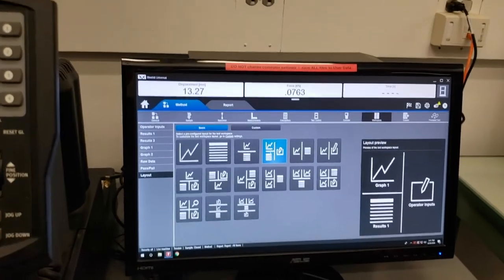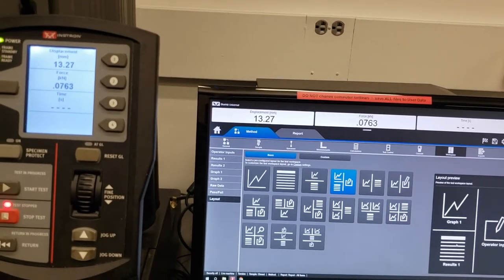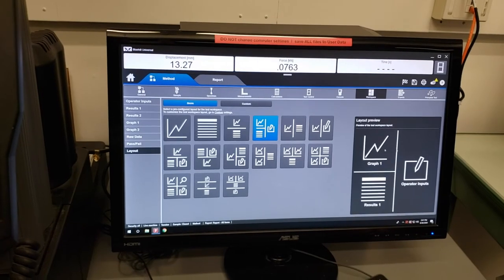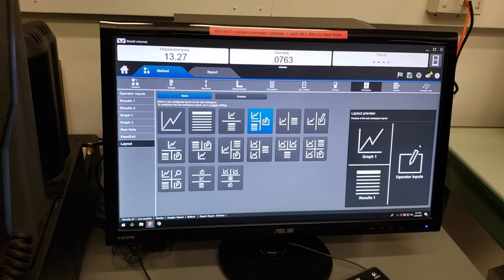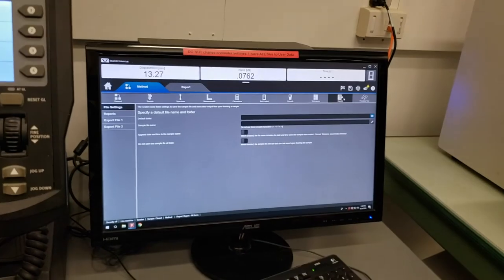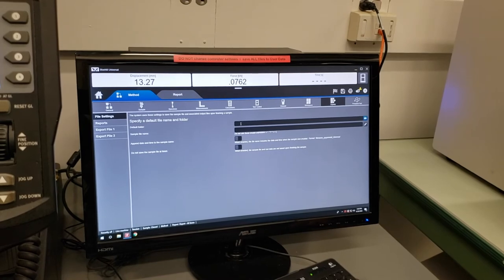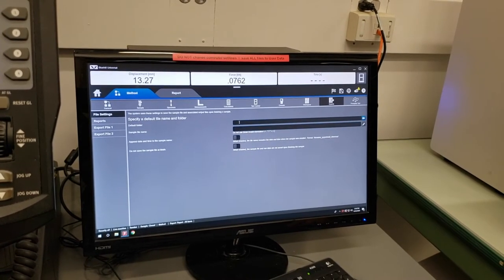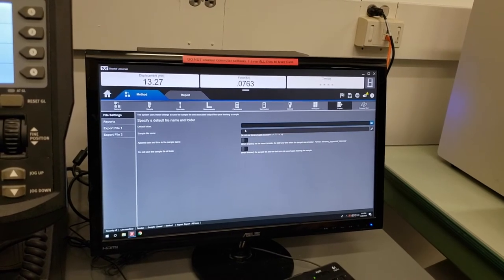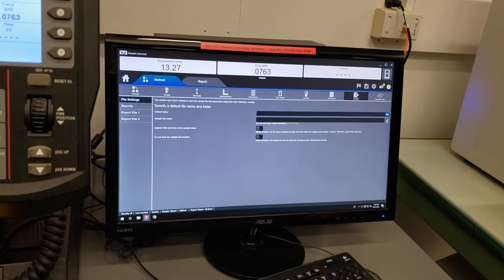Finally is layout. Our default is just fine: operator inputs along the right side, a graph in the top left, and results in the bottom left — showing both a graphical and tabular summary of results with operator inputs alongside. Next, exports: this determines how we get the data at the end of our test. You can specify a default folder and a default name. Since this method could be used for multiple samples over several weeks or longer, a default folder is more useful than a default sample file name. If you do put in a default sample file name, I recommend adding date and time to the name so you can distinguish between samples.